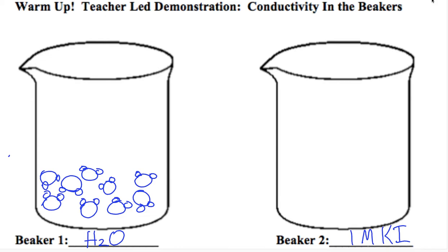So let's take a look. Okay? Kind of cool, right? All right. I'm going to put that in here. It's my little rinse thing. All right, so what do we see in this beaker then? Water, and we're going to exclude the water, and we're not going to solvate all these ions, but what's making the electrical current? K pluses and I minuses.